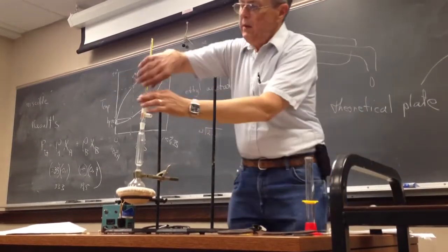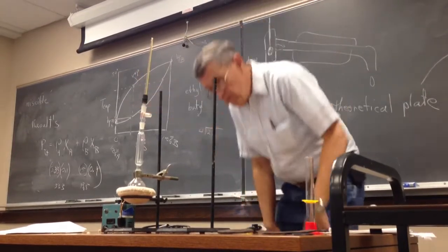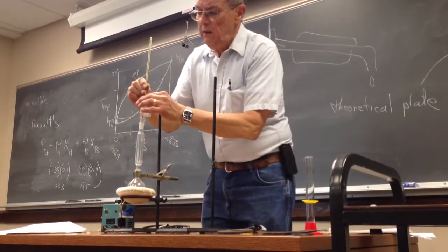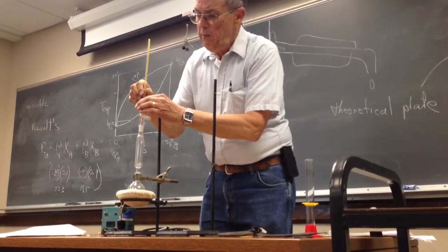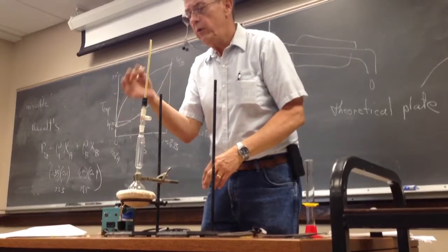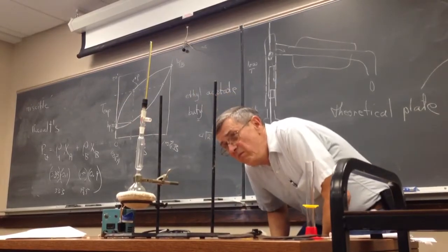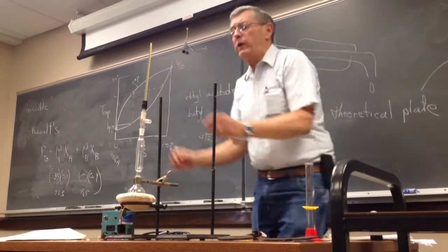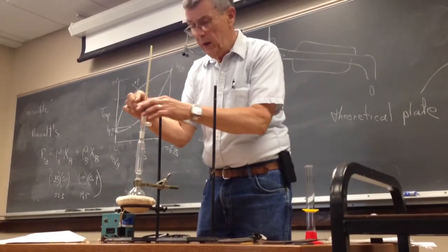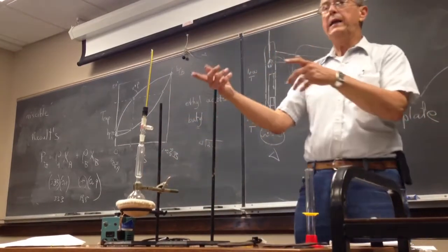Pretty close. Maybe it needs to come back up just a little tiny bit. Yeah, that's almost right. I'd like it up just a teeny tiny bit more. It's the low range thermometer, so that the range you're interested in isn't hidden down in here. Yep, I think that's pretty good. Now the thermometer is going to read the temperature that I want it to read relative to where it is in the apparatus. Now I've got to condense it.